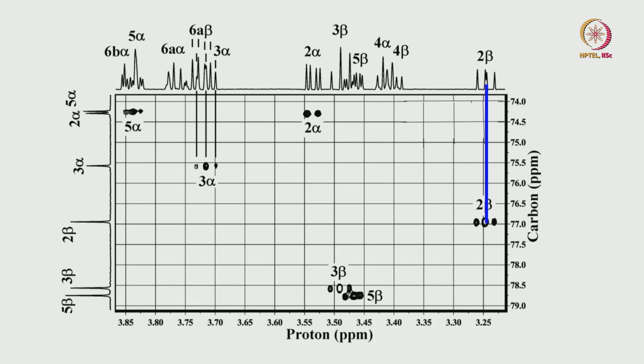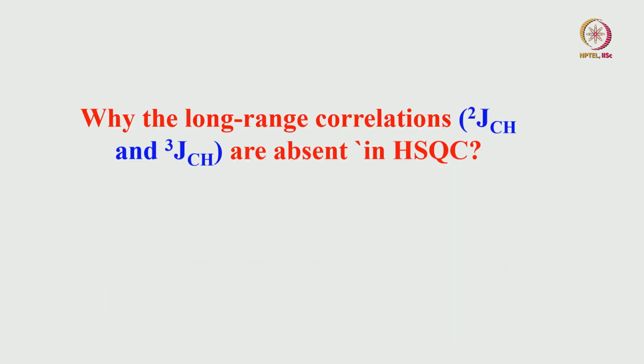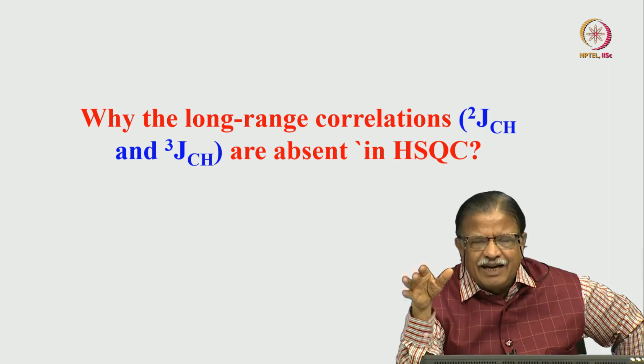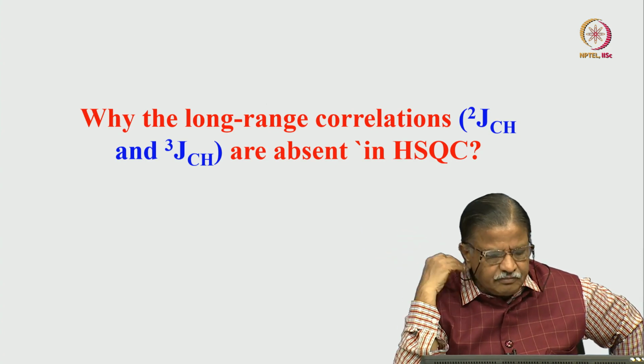This is the beta isomer, proton 2. This is carbon 13. Similarly, this is for 5, this is 2, alpha, all beta and alpha carbons. Protons we can get chemical shift also. Of course, from HSQC also you can get the proton chemical shift. Since you already analyzed the COSY spectrum, very easily we can go and continue with this. Of course, the HSQC spectrum is fairly easy to interpret, like the HETCOR experiment. There is no difference at all.